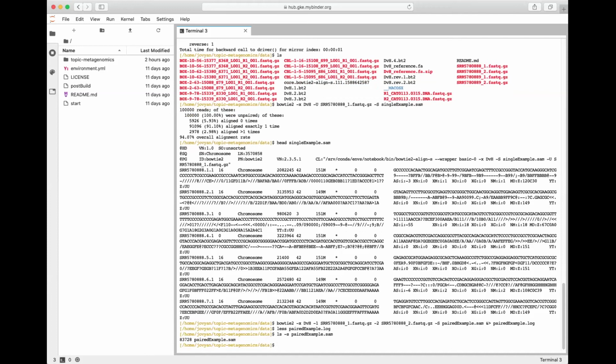This tends to add up because we're only talking about 100,000 reads here. And when you have a lot of samples and every sample has millions of reads, these files get really, really big. You certainly do not want them on your personal machine, and you also don't want them hogging the server. So SAM has a binary format to it, which creates much smaller files. It's called BAM.